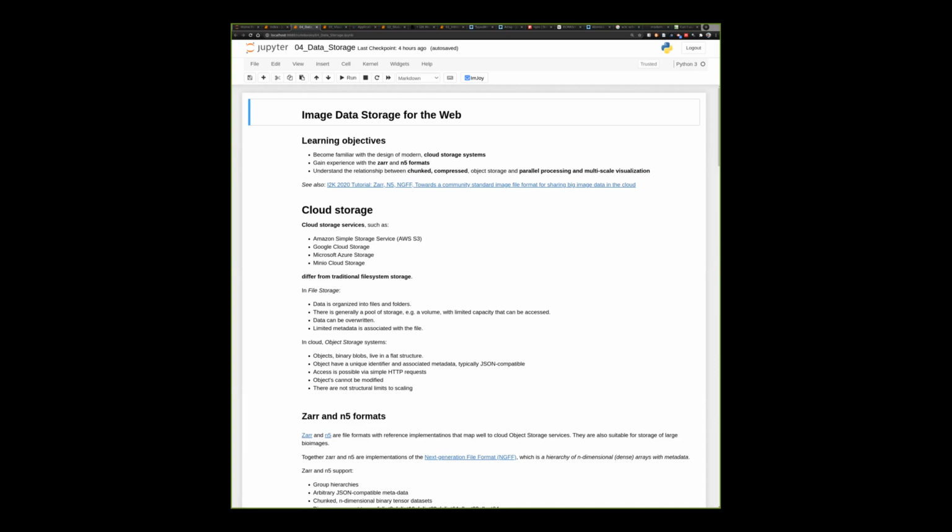There is another tutorial going on this week that was created by one of the lead authors of these new standards, who's organizing the standard, Josh Moore. Take a look at that if you're interested in this topic. That should be a more comprehensive tutorial.